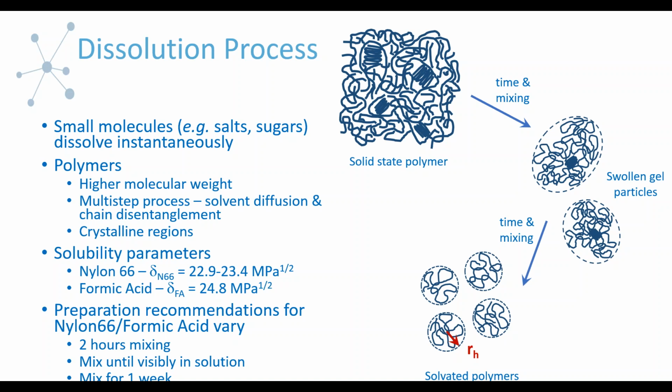And I will mention that, ultimately, as you can guess, we continued mixing these formulations and then tested them again. And I will say that visibly, just with the naked eye, I could not see any difference between what happened after 2 hours and what happened after a week. So it's important that you can't necessarily go by visuals alone.